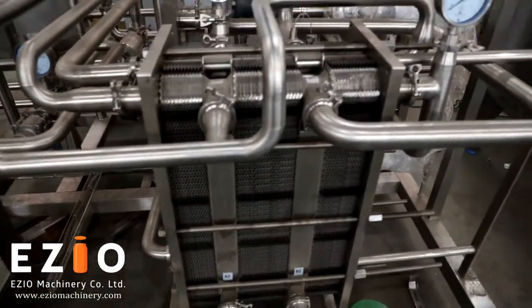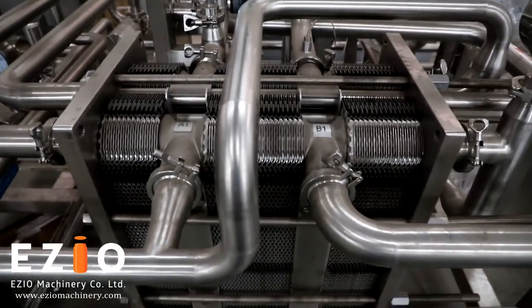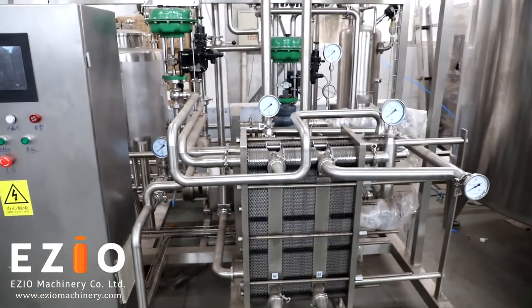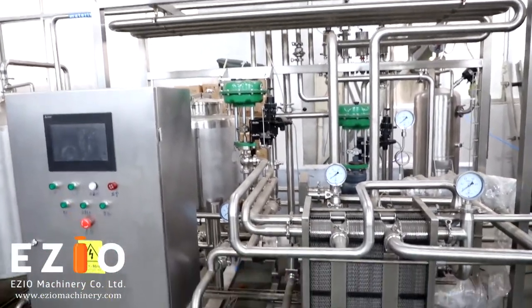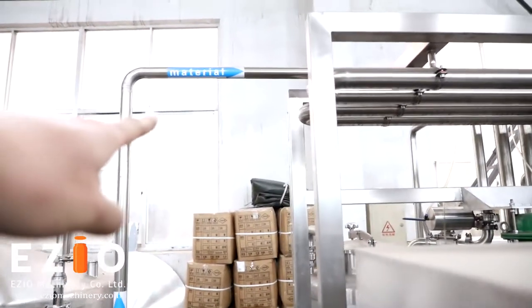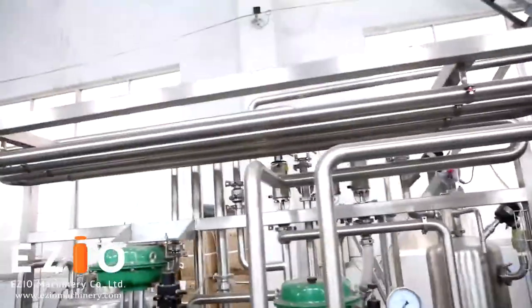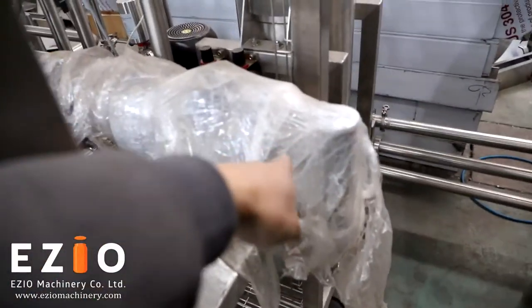This is a 3-zone heat exchanger. The material comes from there, from the top. And you are going to connect the steam from here.